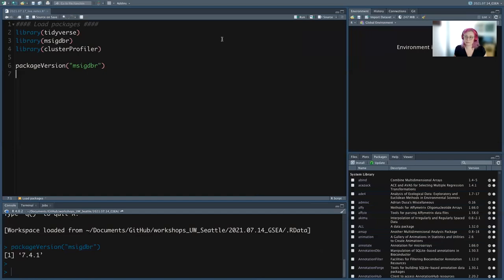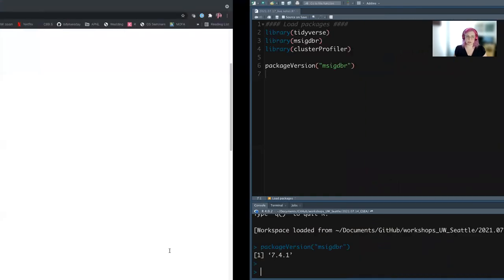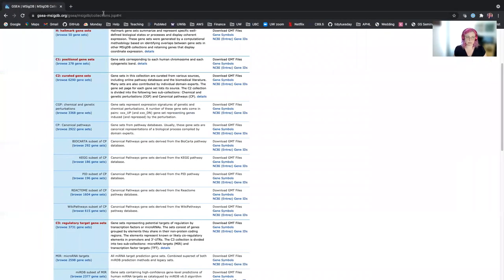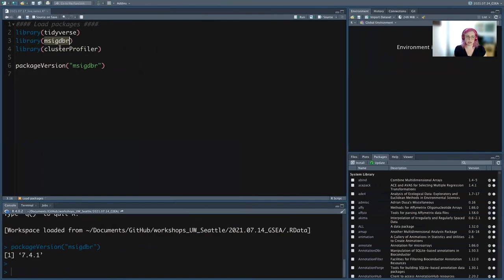Question: when I downloaded the project and opened it in R, I don't have msigdbr or clusterProfiler installed. Did I download something wrong, or was I supposed to pre-download those packages? Yes, you need to pre-download them with install.packages. msigdbr is on CRAN, so you can just do install.packages. clusterProfiler is on Bioconductor. cluster profiler might give you an error, but it'll list a couple lines up which dependent package failed to install — install that first and then rerun. They're pretty small packages, so they should download fast, unlike the tidyverse which takes forever.